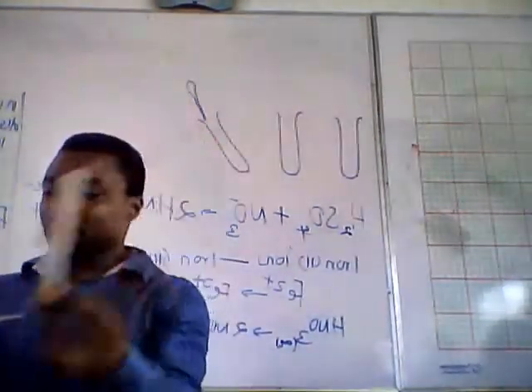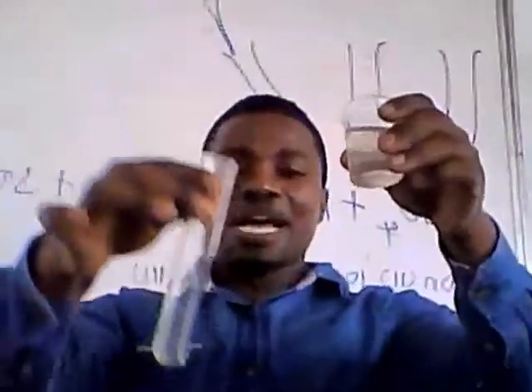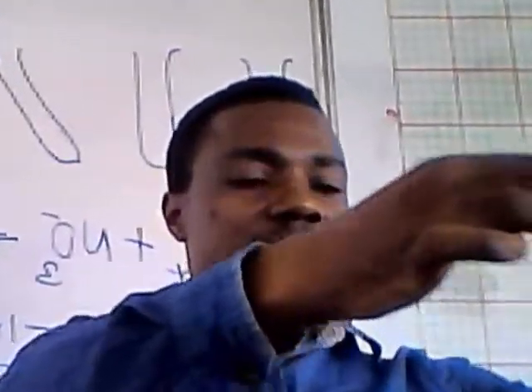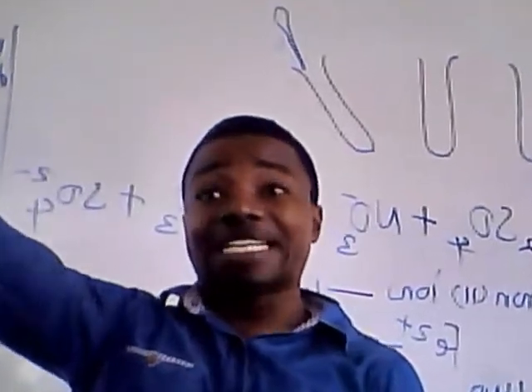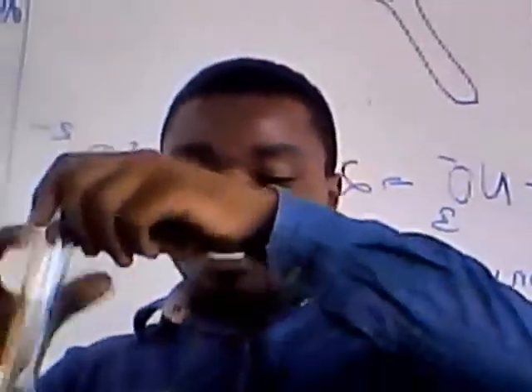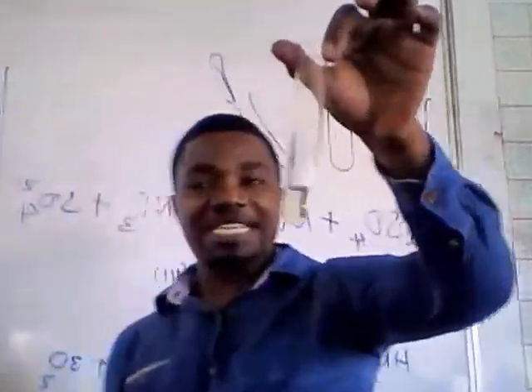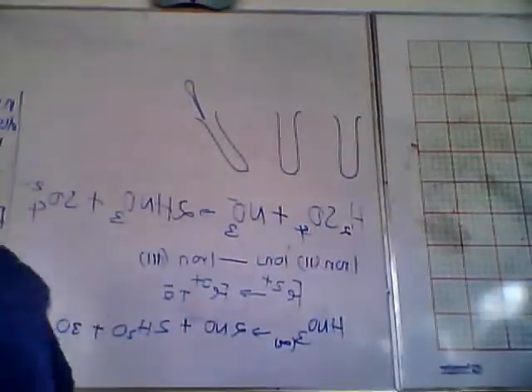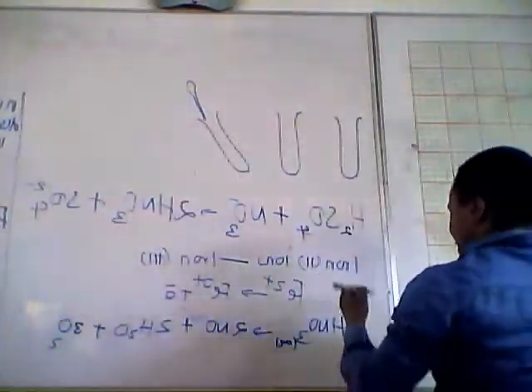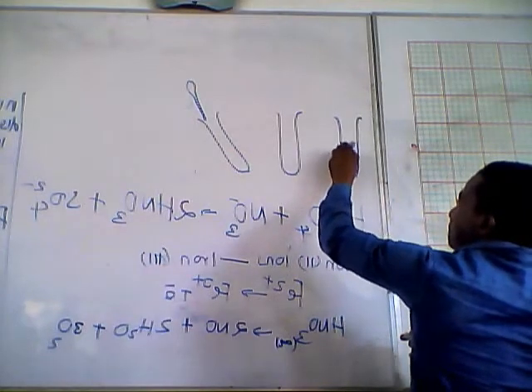Because we don't want to mix, make a solution of the suspected nitrate and place it in a test tube. So I have put in my suspected nitrate — it is now in a solution in a test tube.